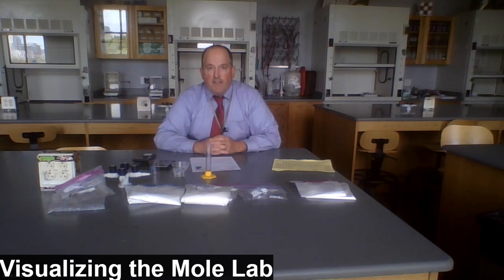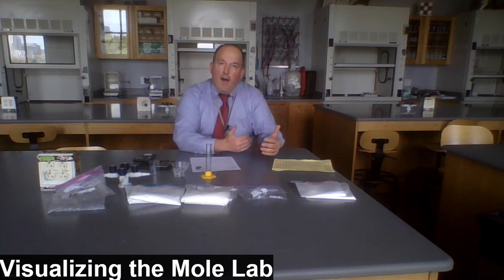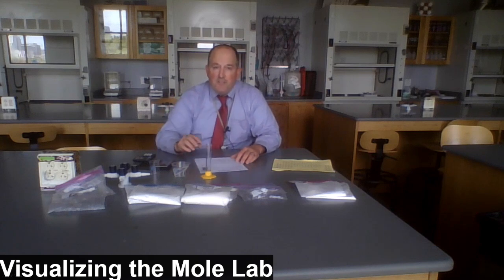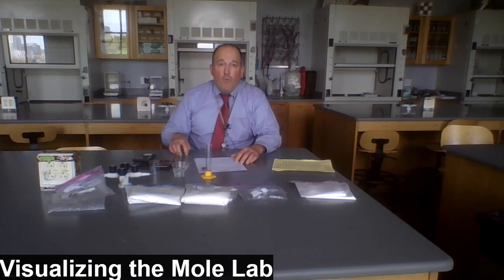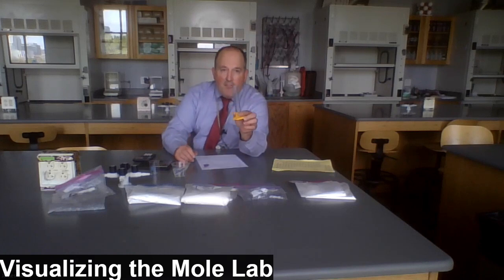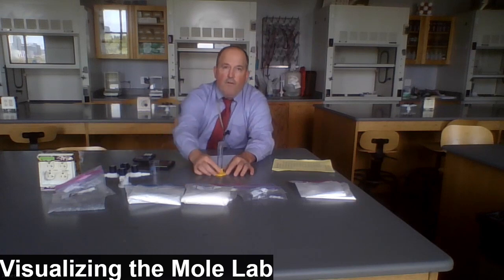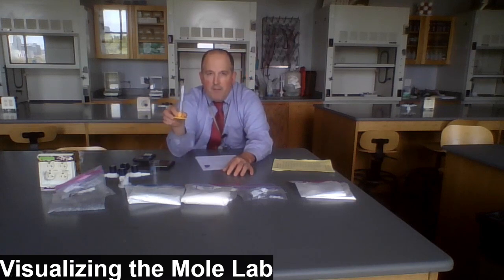Now, Avogadro, the Italian scientist, discovered that if we've got a certain number of atoms, then that atomic weight in AMUs, or atomic mass units, is equal to its mass in grams. And as it turns out, that same number of atoms would apply regardless of the substance that we're dealing with. So let's start with water. If 1 gram is equal to 1 milliliter, and I have a grad cylinder here, if I pour out 18 milliliters of water, I should have 1 mole of water. There we go. So I've poured out 18 milliliters of water.